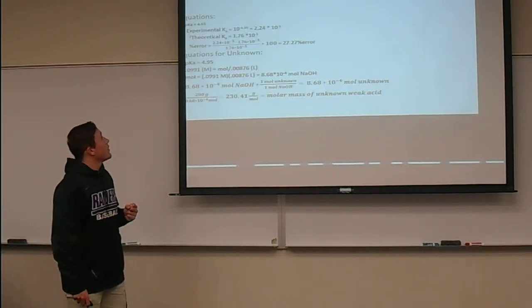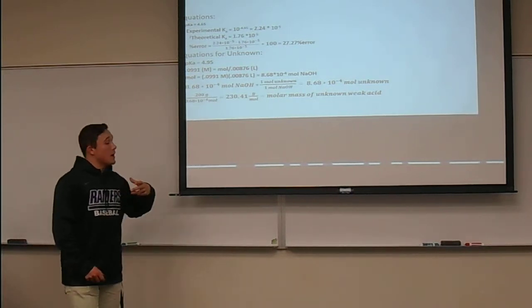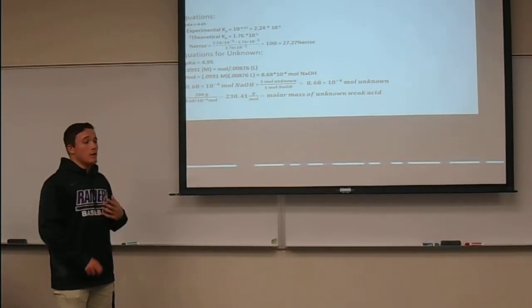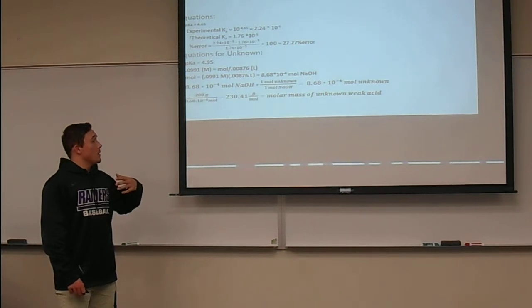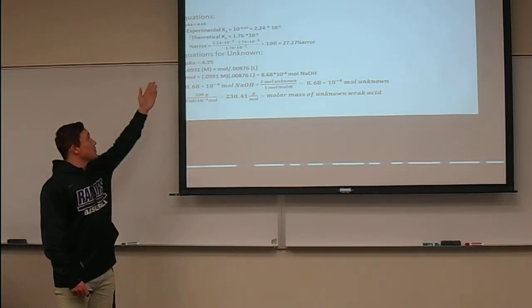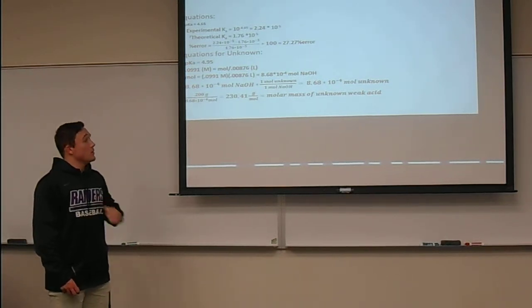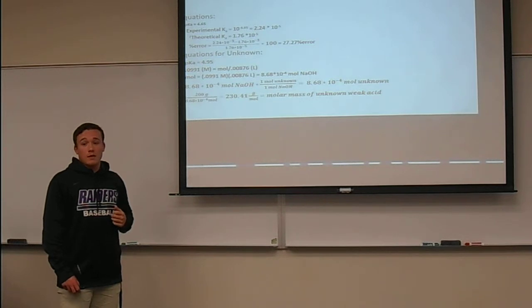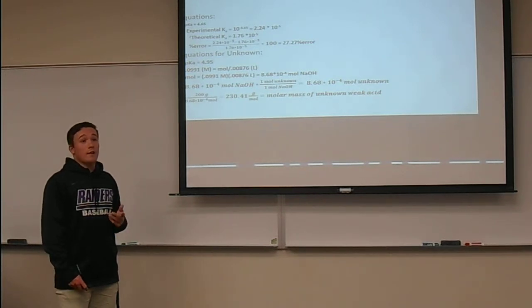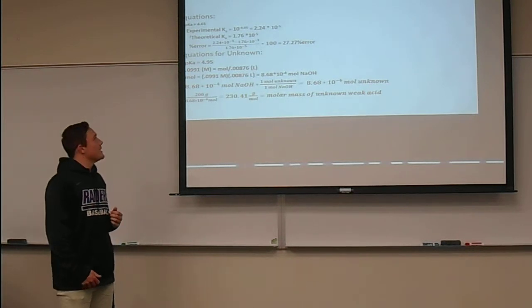For our calculations, since we find our pKa from the graphs, we can then do our experimental data up here, compared with the theoretical values, which I got from UCSB.com in their PDF about all of the weak acids and their Kas.